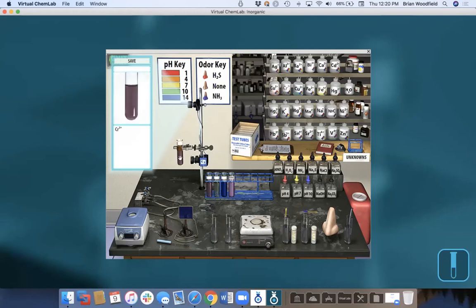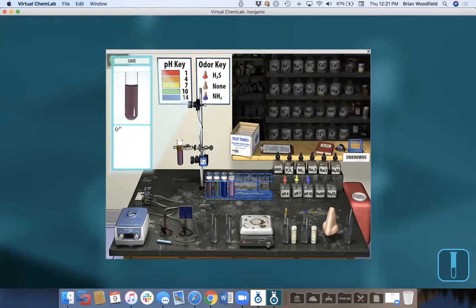So for example, here's chromium. The purple color comes from a certain d-level splitting from the water ligands on it. But what's interesting, if I go to base, sodium hydroxide, and click my peroxide, I'll oxidize it up to my chromate. But then if I go back to the acid, I'll go back to the chromic ion, but notice it's green instead of purple. By oxidizing and reducing again, it changes the ligands, it changes the d-level spacing, and we change the color. So this is real chemistry, again, not predicted based on solubility tables.